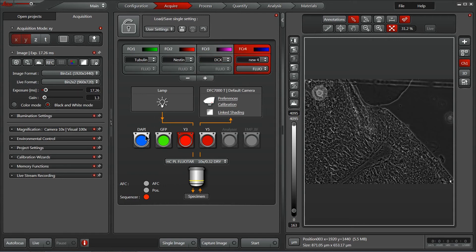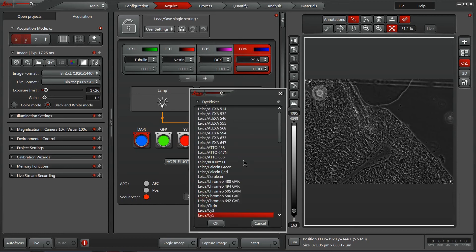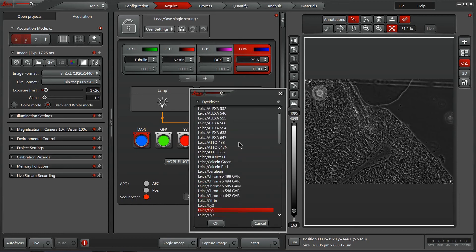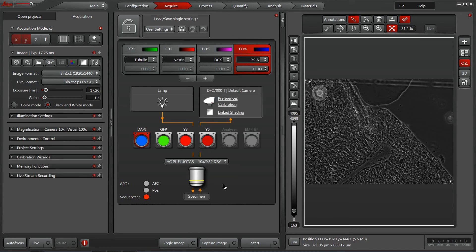And last but not least, the ever-popular Dappi channel. Dappi itself is a nice and bright one, so most folks are using it. I've got a PKA labeled here with Dappi. Right-click properties, and let's see, where's Dappi? There we go.